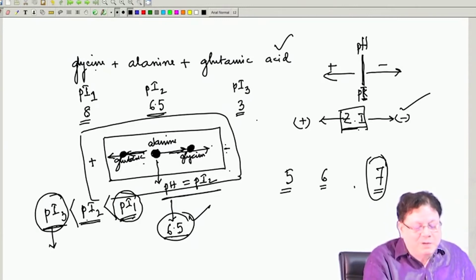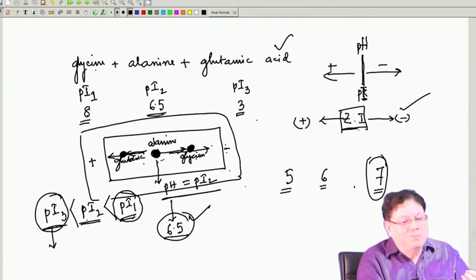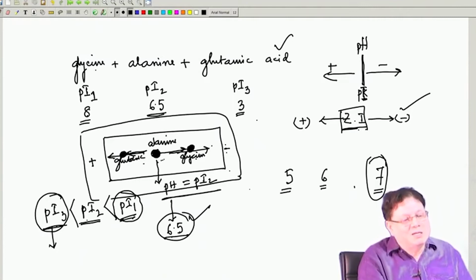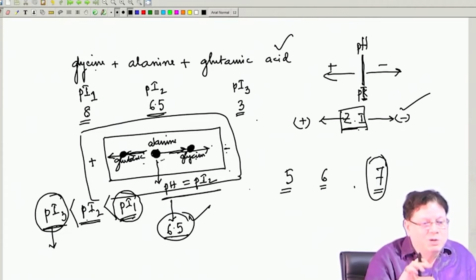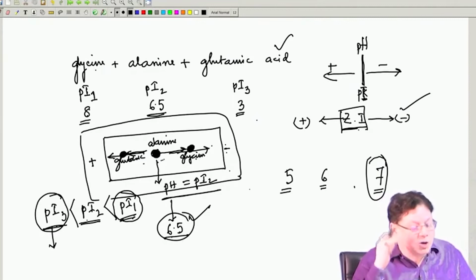So, we can easily pick out that if the choice is between glycine and serine, then serine will have a lower mobility than glycine under the influence of the same applied field. Okay. So, even if you have 4 amino acids, their mobility, equivalent to what is called RF in organic chemistry, that means the amount of movement related to the solvent front.